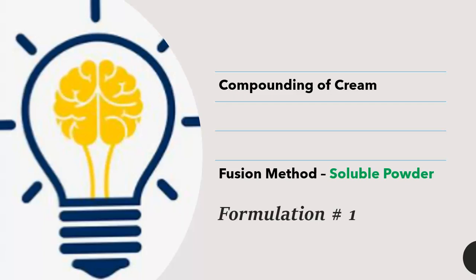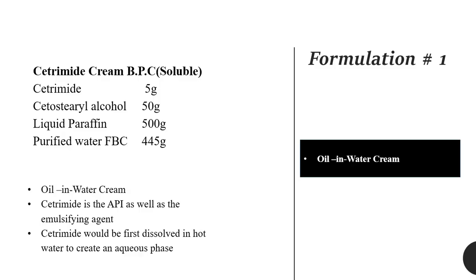Let's look at a recipe or a formulation with a soluble powder. Now on screen you have cetrimide BPC cream. Now these are old recipes, but they do demonstrate a principle, which is what we're carrying across in these videos.